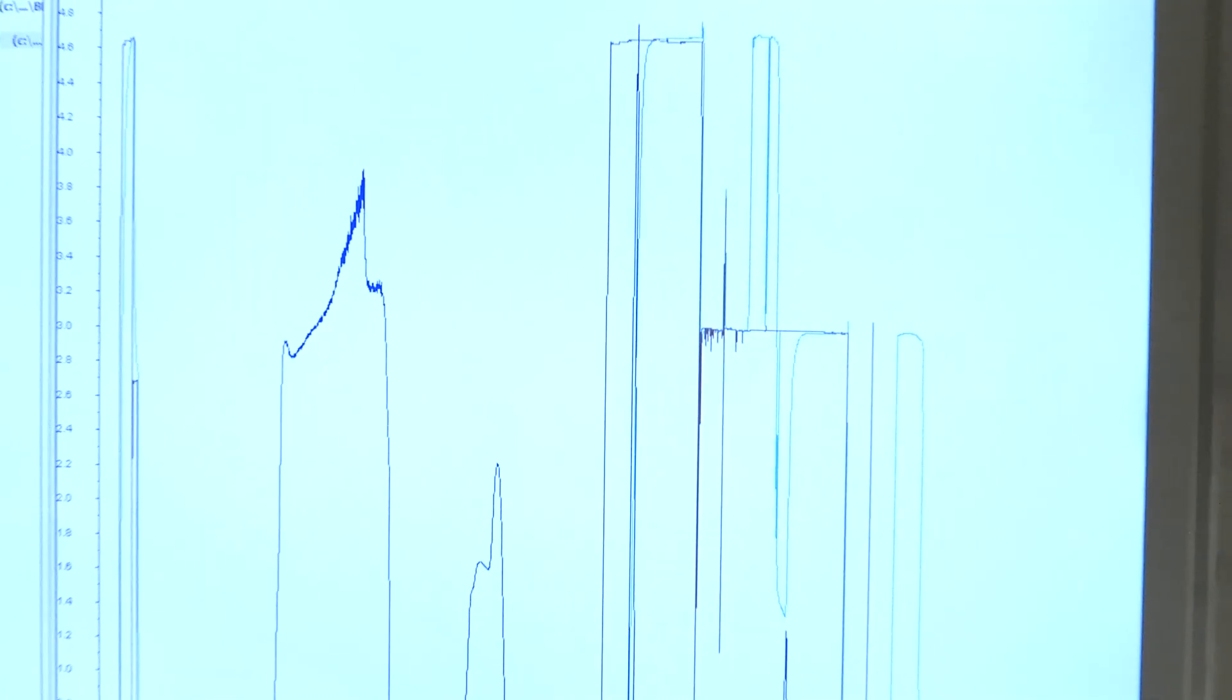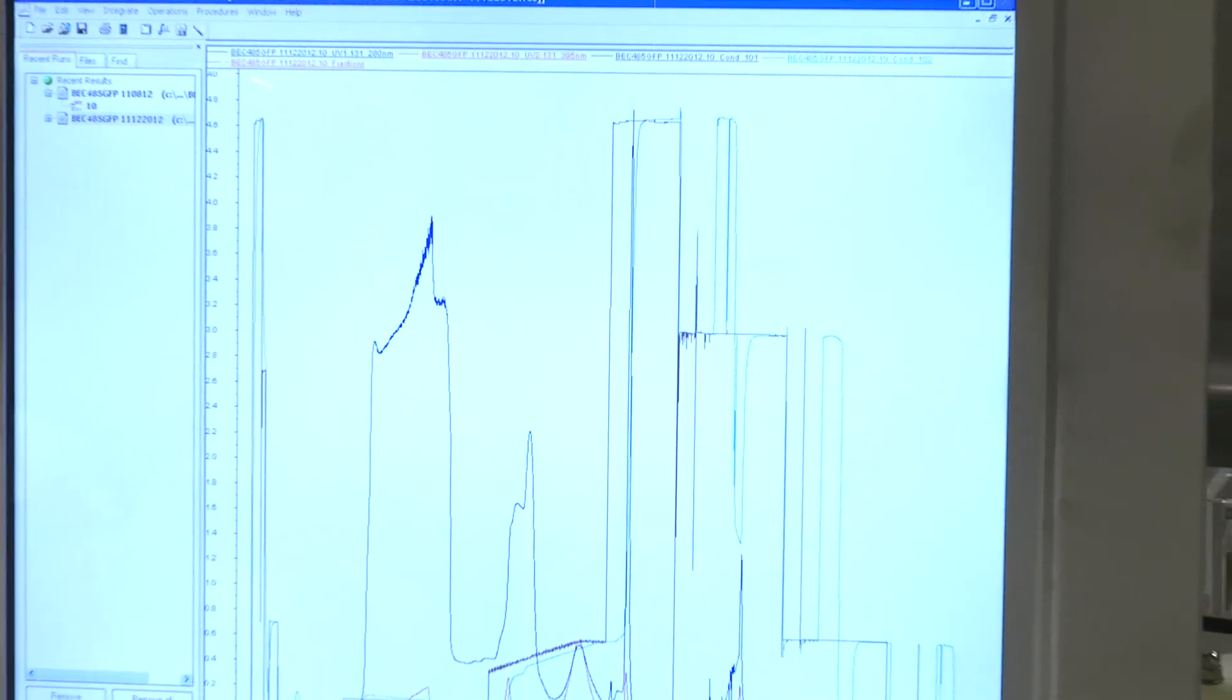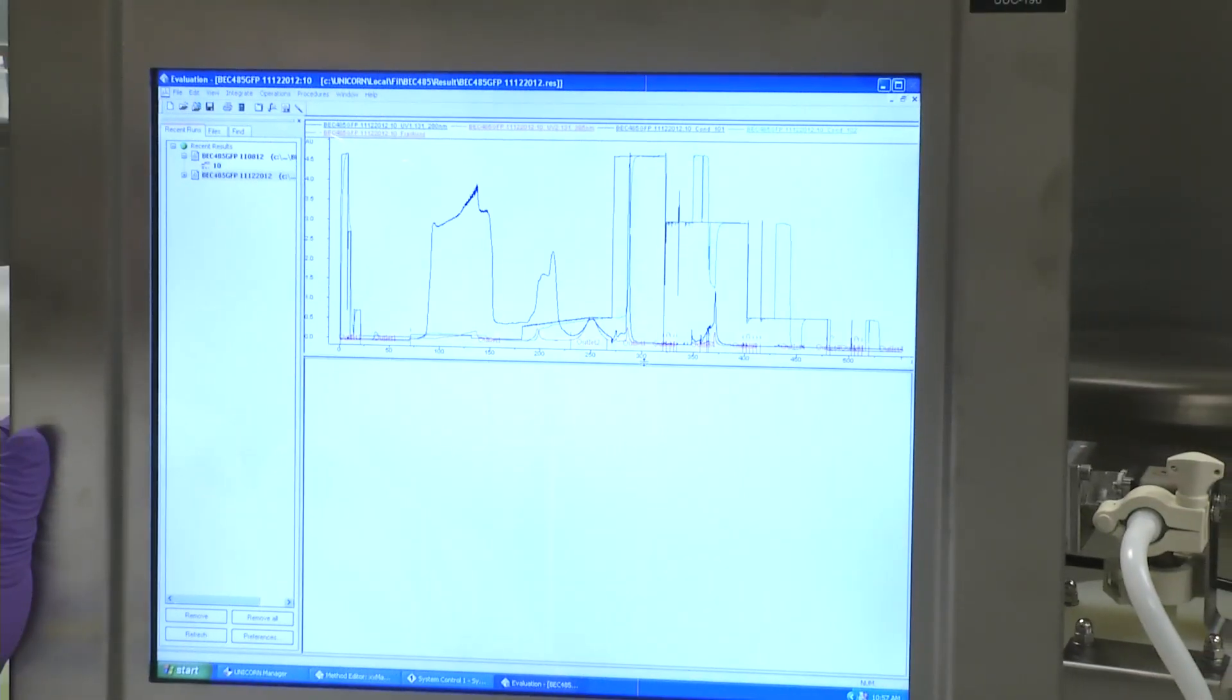At this point in the process, tangential flow filtration is used to concentrate and diafilter the GFP product stream.